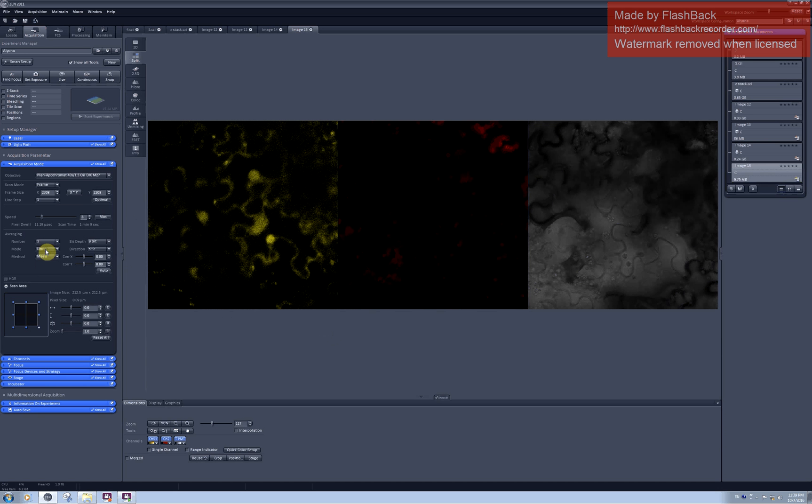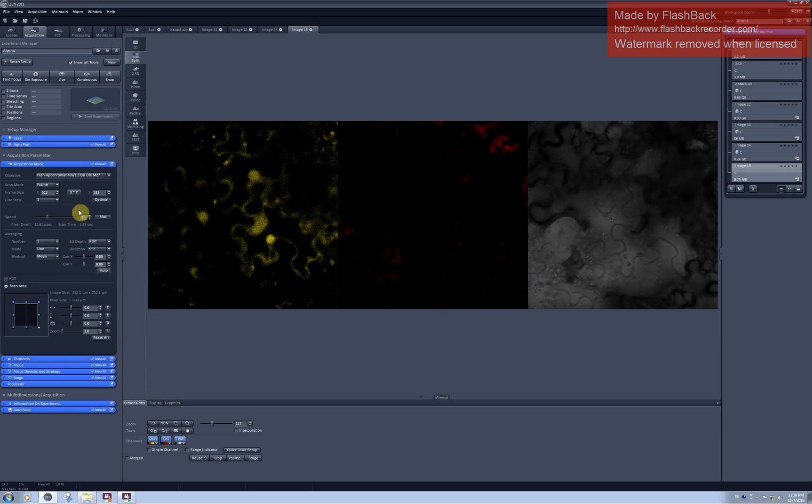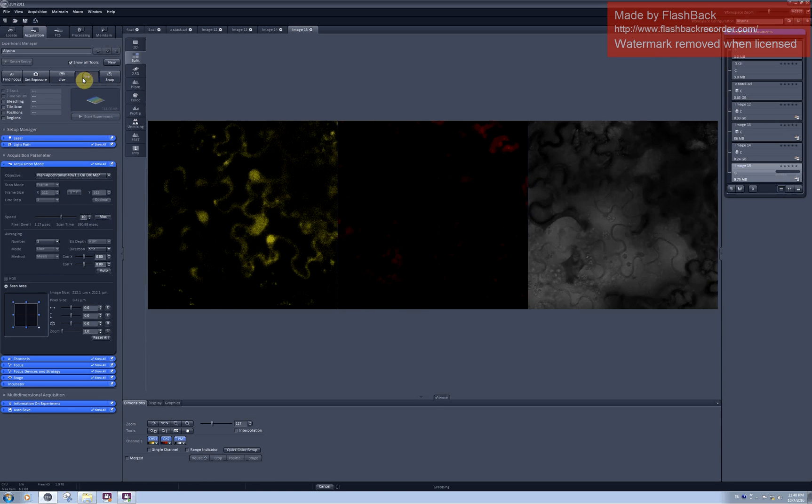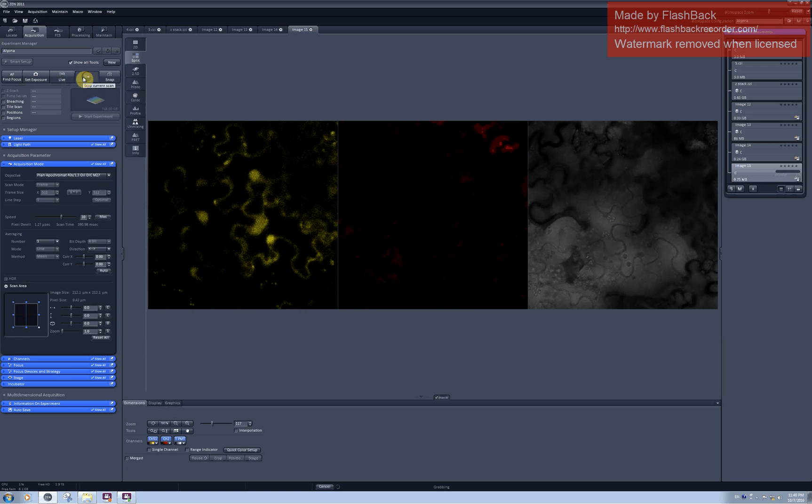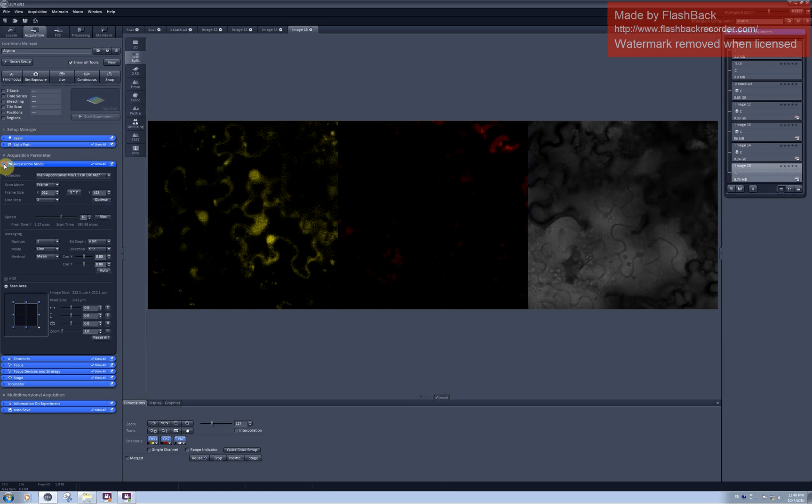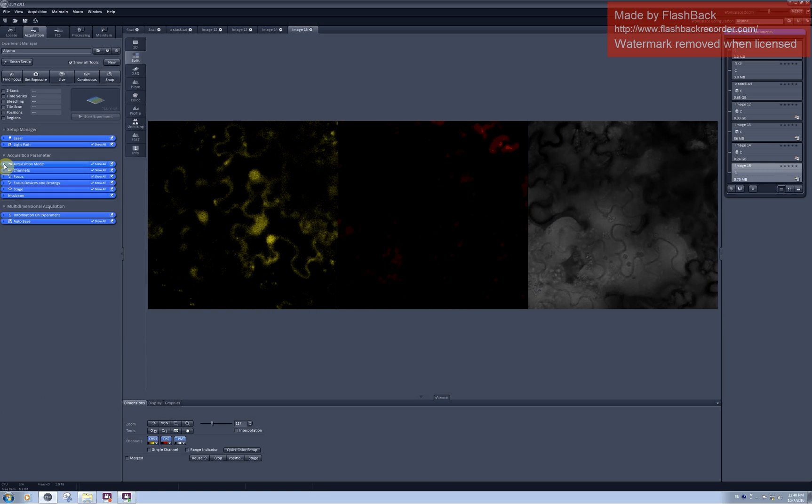So I will decrease the averaging to the minimum, decrease the resolution to the minimum, and also speed up the scanning. And as you can see now I have only 400 milliseconds per frame. And I can check the quality of the image and it looks still recognizable. And now I can continue with the bleaching experiment.